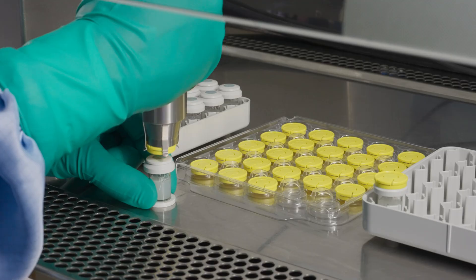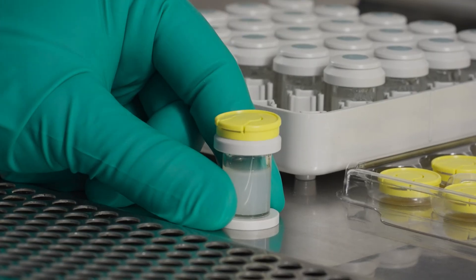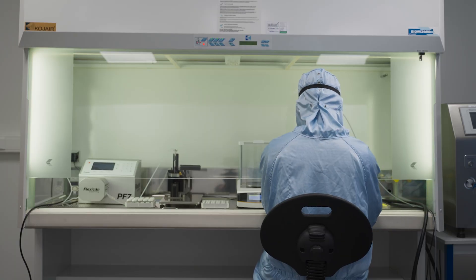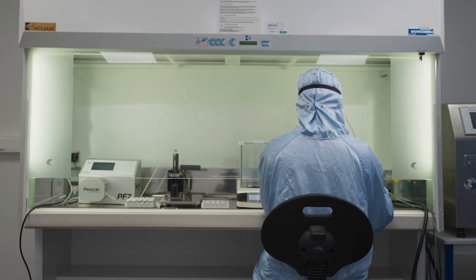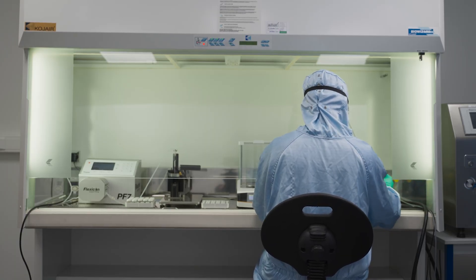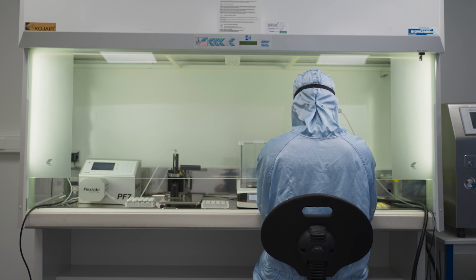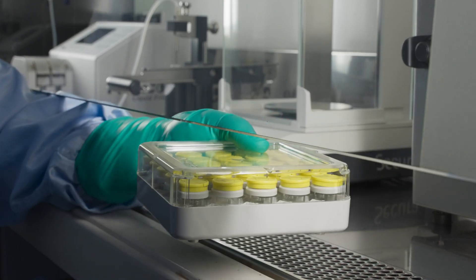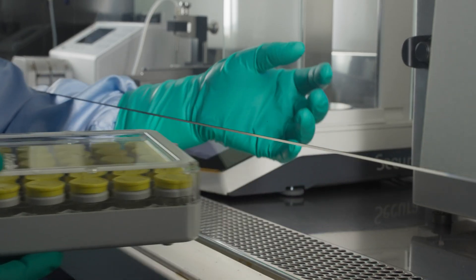To complete the process, the operator uses the capping tool to place a snap-fit cap on the vial. The M1 filling station provides flexibility on a small footprint, increased safety, and ease of deployment and validation — making it an optimal solution for your fill-finish operations.